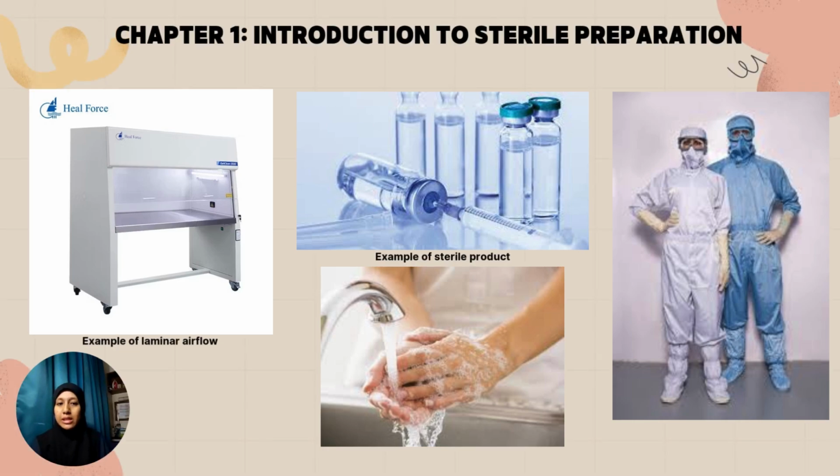In this picture, we can see the equipment and the engineering controls, which is the first picture, we have the laminar airflow workbench and also the aseptic technique that I mentioned before, which is the full set of gowning and also hand washing.